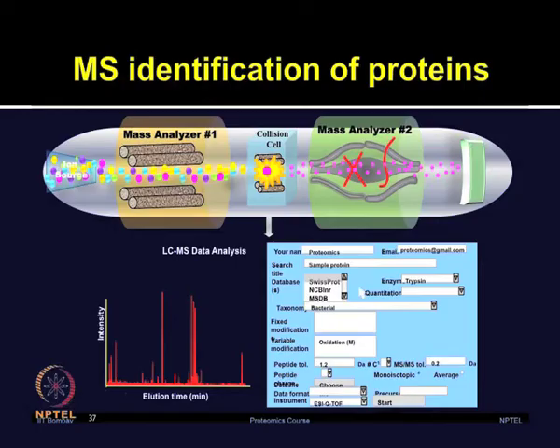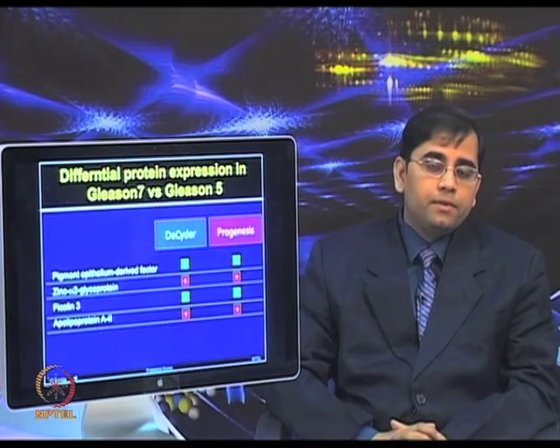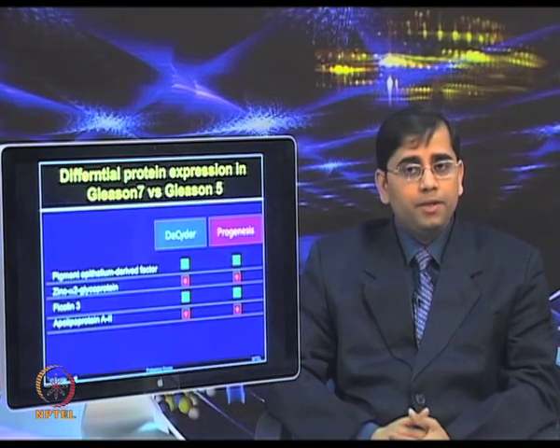The proteins excised from the gels were analyzed by using a Finnegan LTQ mass spectrometer, and data from these MS experiments were analyzed by using the BioWorks browser with the Sequest program. After mass spectrometry was done, the identity of these proteins was established.